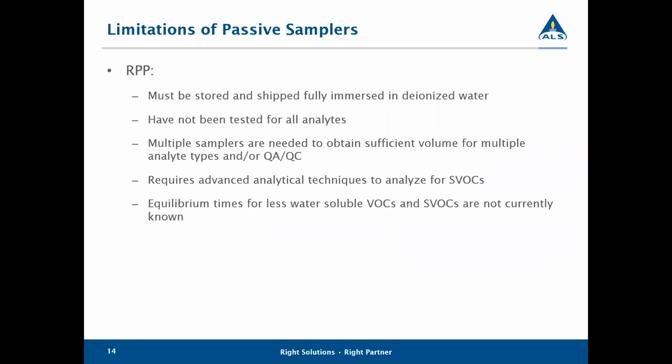The RPP, I had mentioned it does need to be stored and shipped fully immersed in DI water. We send them to you in that polyethylene bag. It's just up to you to keep it in there until it's ready to be deployed, and that's to make sure that you don't lose the DI water that's within the sampler, which is ultimately going to end up in your sample bottles once it's reached equilibrium. The RPPs haven't been tested for all analytes.